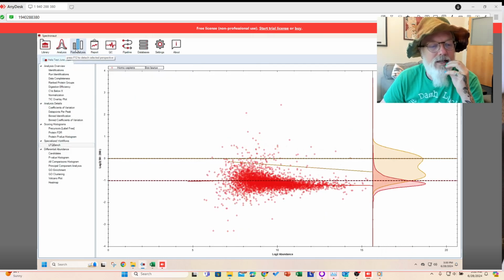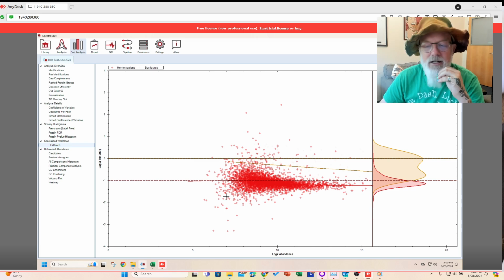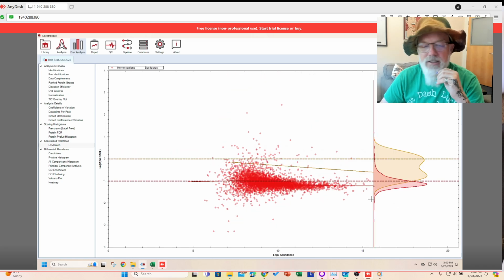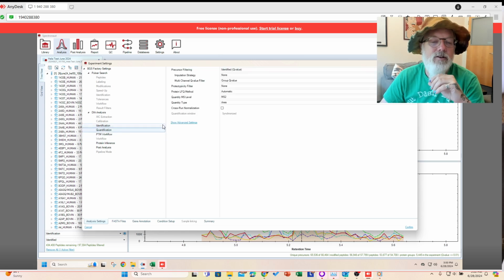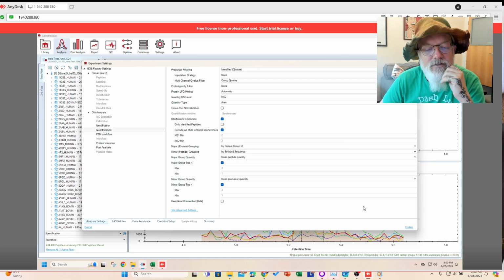And let's quickly look at the LFQ bench, and let's make sure this display, and you can see it's worse. So it should be centered at 2, and it's more about 1.2. I think it was like 1.6 before. So it actually made it worse because we want this to be here, and it's not. But I don't expect deep quant to work for such an artificial experiment like this. So anyway, I'll try it with a spiked in experiment and see if that's better. So we're going to turn that off.